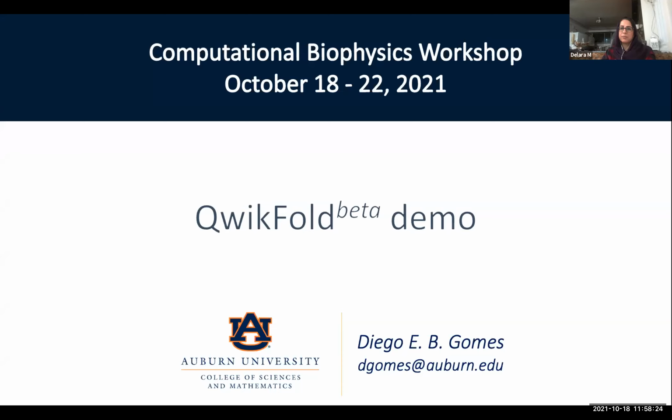They are pretty reliable, but there might be a reason for you to change one of them. There are cases where you might be biasing the system into a conformation that is not so standard, and then you need it. In that case, you can either change it in the PSF directly, or you can get another force field parameter file and then create your PSF based on that file. That's getting to the more advanced kind of user, but it's not too complicated. Most of the time, the PSF that is automatically made is fine for the simulation. For 99.99% of the cases, yes.